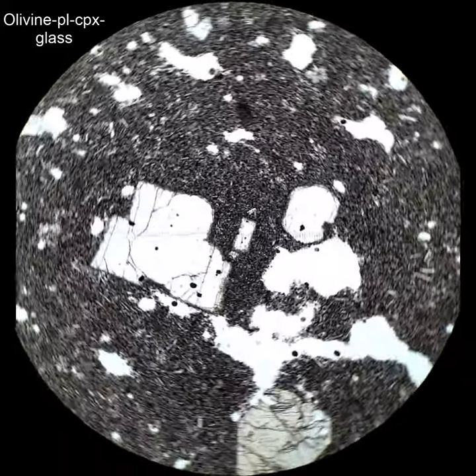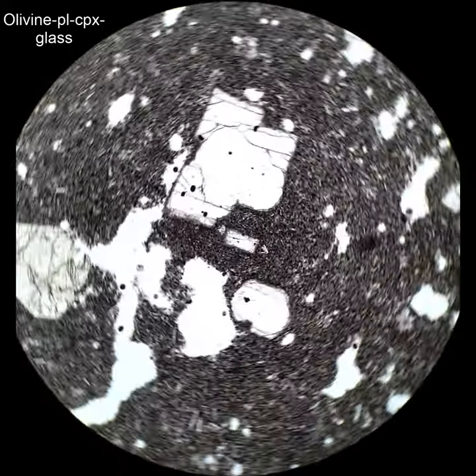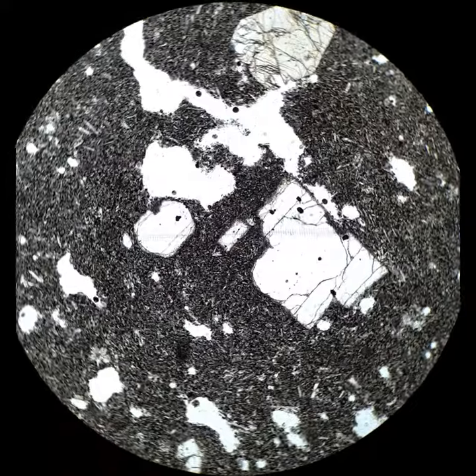More coarse olivine crystals. And again, you can see those kind of arcuate fractures.